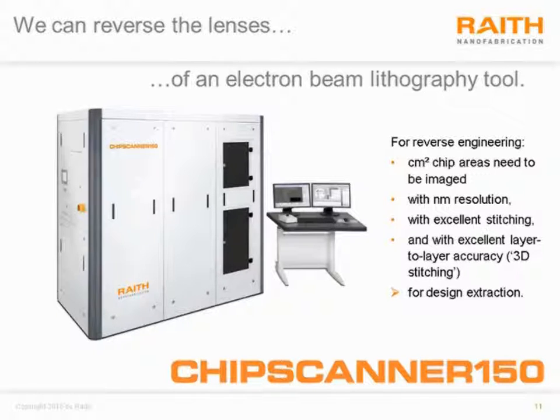So the chip scanner is, in summary, a high-resolution scanning electron microscope that brings the advantages of decades of advancements in electron beam lithography instrumentation to scanning electron microscopy. It has special advantages over traditional scanning electron microscopes, those advantages being stitching accuracy, automation, and also speed.